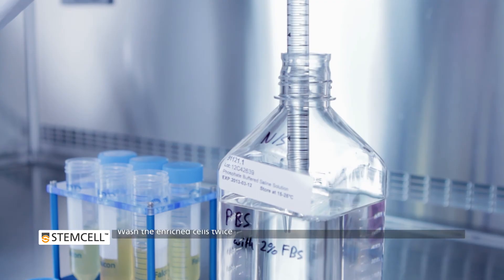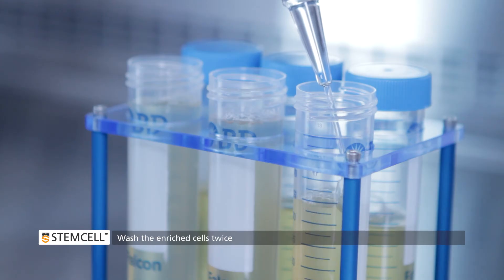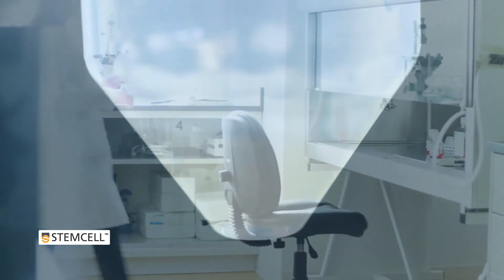Finally, wash the enriched cells twice. The PBMCs are now ready for downstream applications.